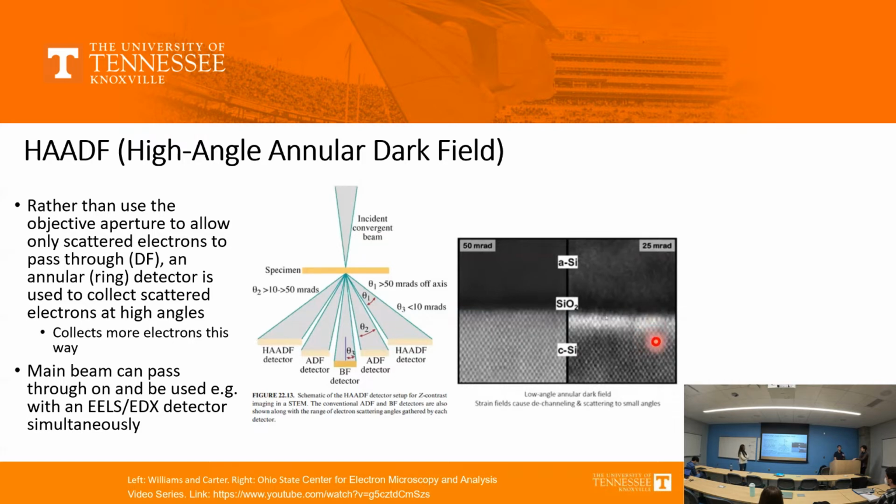One point to make about this is that you don't know, just based on the image alone, what phenomenon is causing that difference in contrast. In their case with the sample, they know that there's probably some strain present here, so that's how they interpret it. So with this annular dark field, you need a little more contextual information to be able to interpret what's going on. But it can maybe reveal things that wouldn't be otherwise specified. And that's something I'll expand on more in my second presentation, because especially with regard to strain around an interface, it's a very important phenomenon for our purposes.